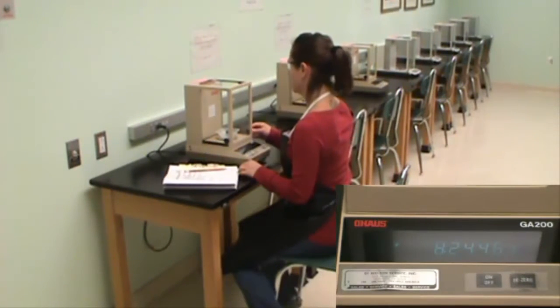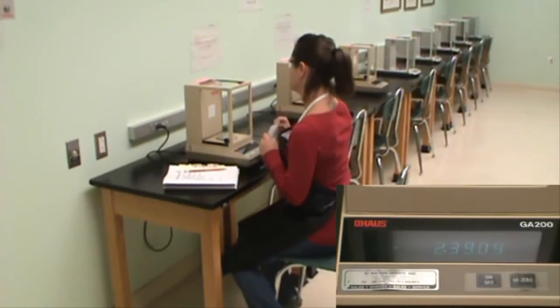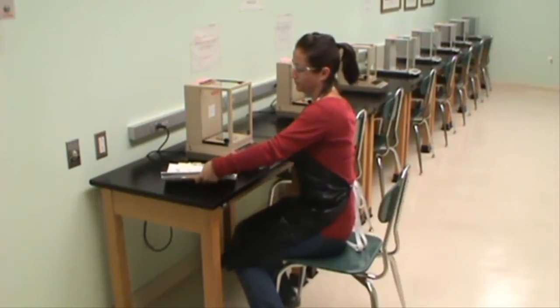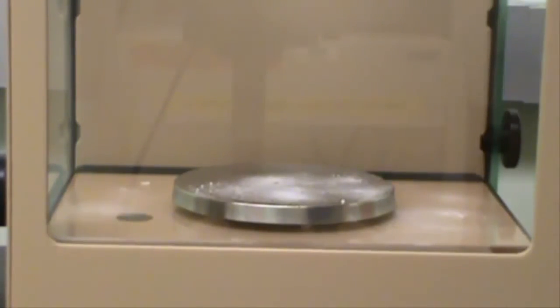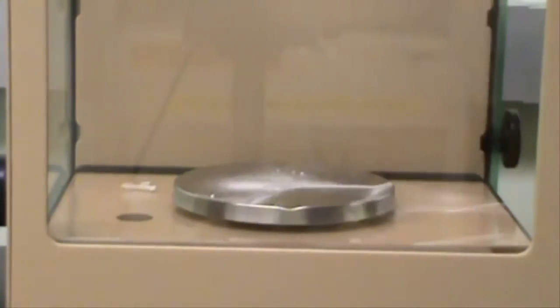Once done, take the weighing boat out of the balance and close the glass pane. Re-0 the balance, make sure it reads 0. Stand up and push your chair in. If you happen to spill any solid inside the balance, use the brush to clean the balance.